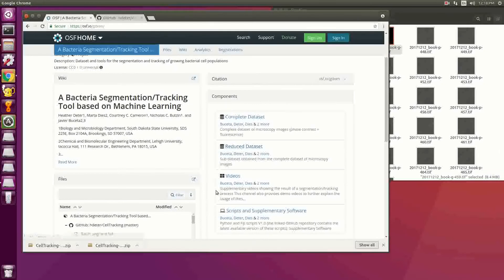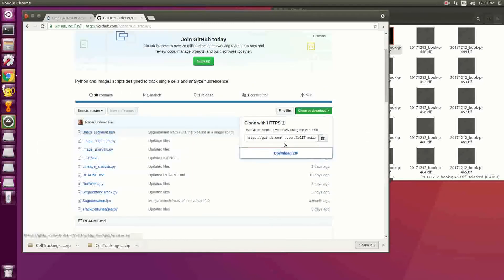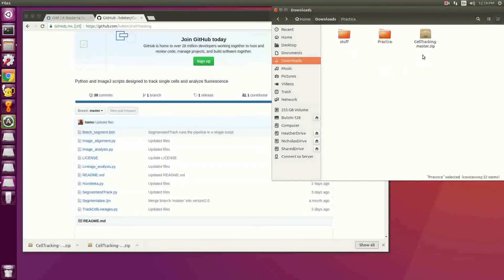I'll detail that a little bit more later. Here is the link to GitHub, which I've loaded up over here. You can just download the zip folder for the master branch and that'll go ahead and download all these files for you. If you're on a Linux machine, which I highly recommend — this also works for Macs with a little bit of extra troubleshooting. The process is a little bit slower on Macs because I didn't program them to run the segmentation in the background. I highly recommend Linux. If you don't have a Linux machine, you can use VirtualBox with Ubuntu, and run everything from VirtualBox. All those details are in the book chapter.